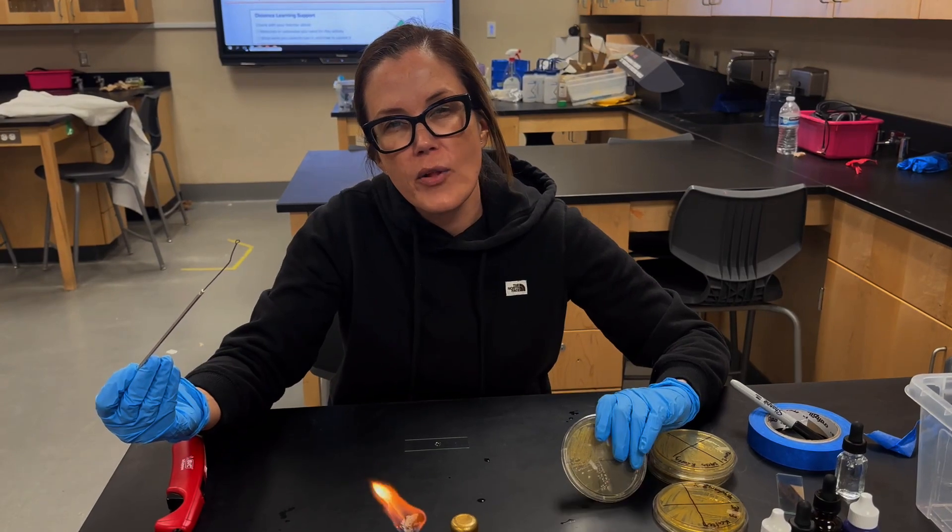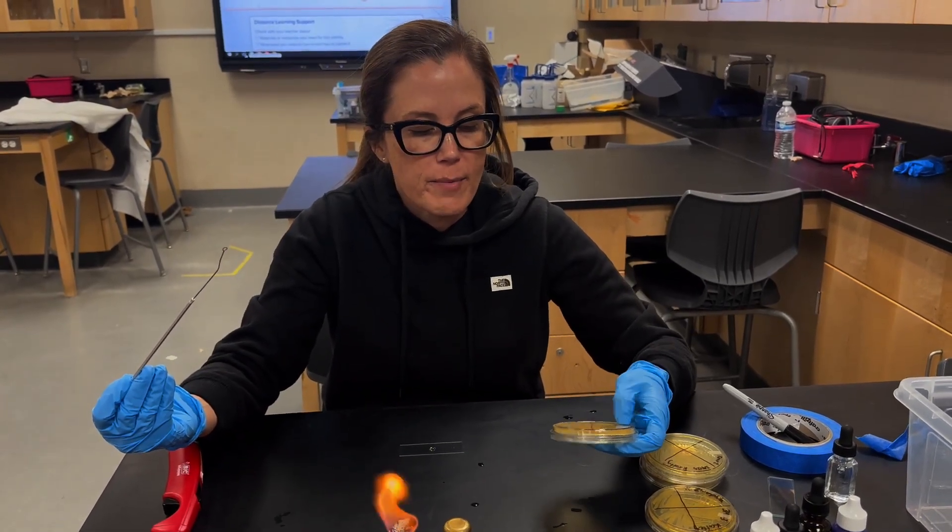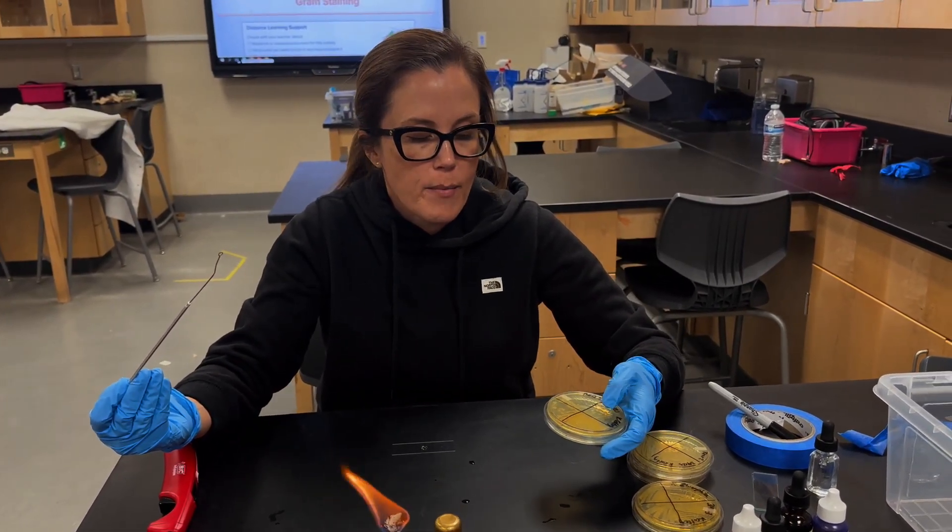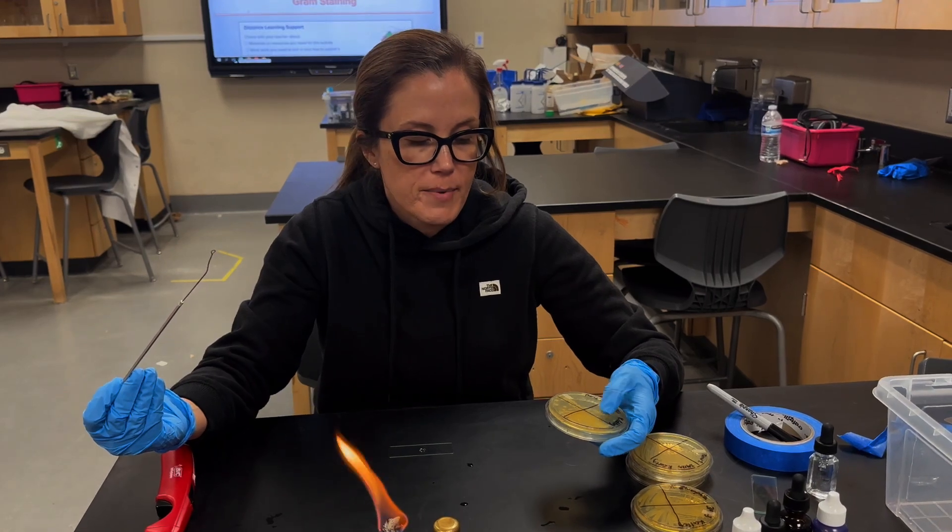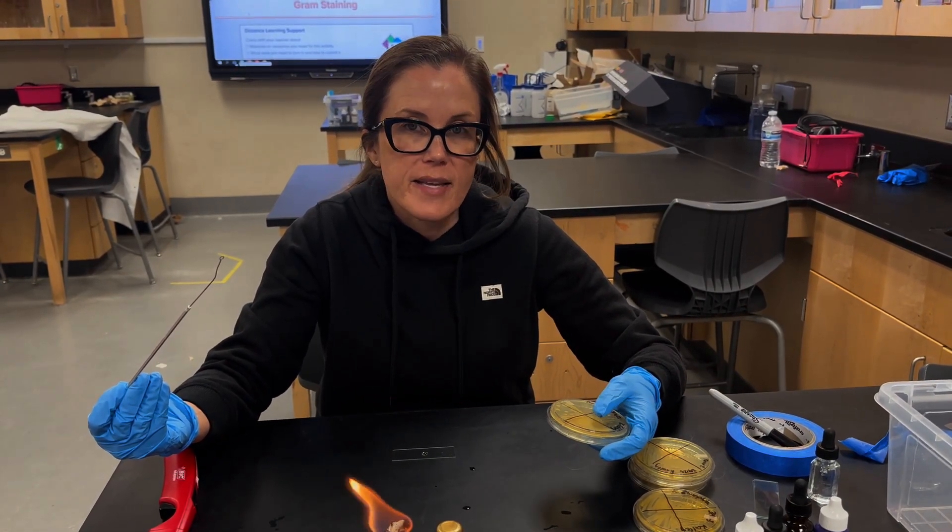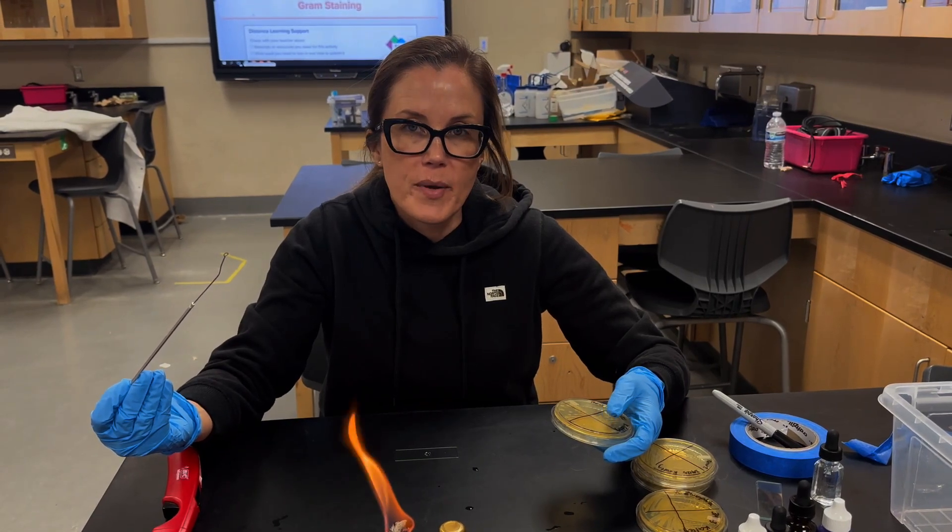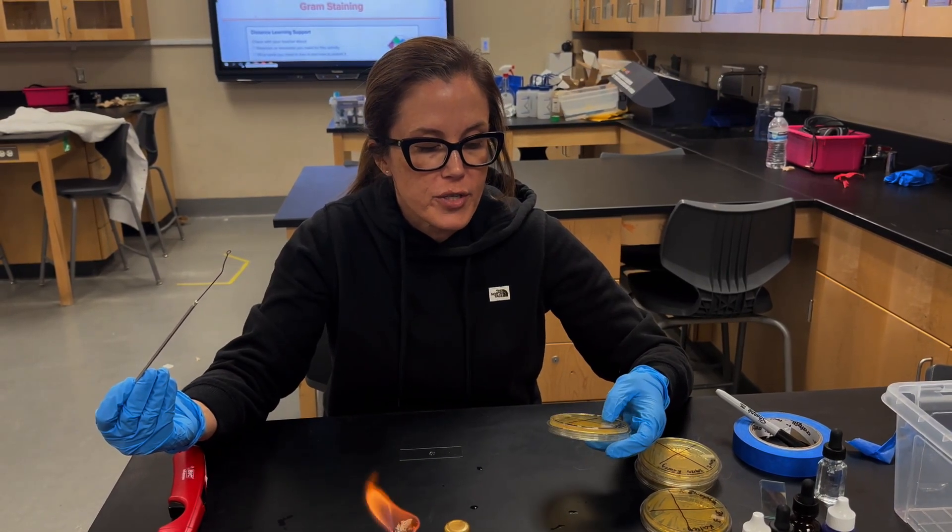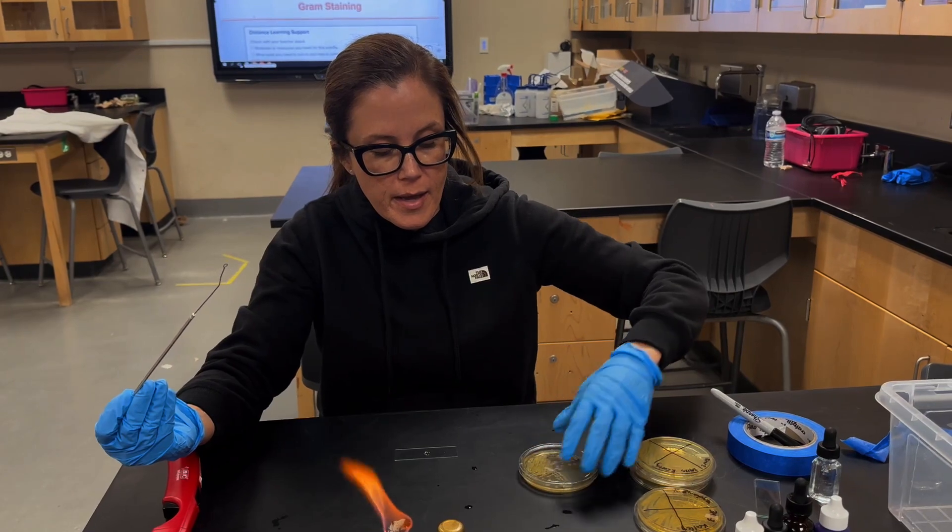The reason we're taking the yellow colonies is because that's the one that we believe is responsible for what's causing the patients to be ill at the hospital. Remember all 11 hospital patients had this yellow colony in common when we did the gross morphology of the bacteria.